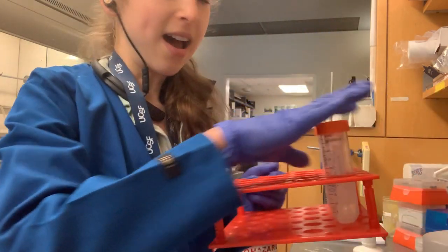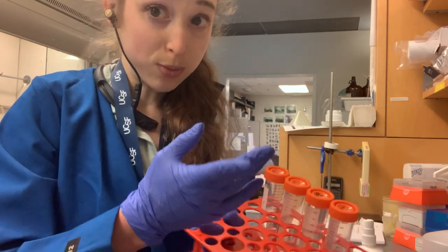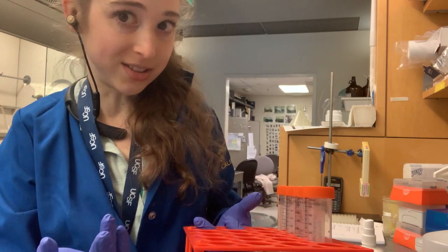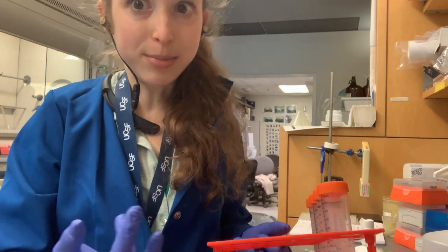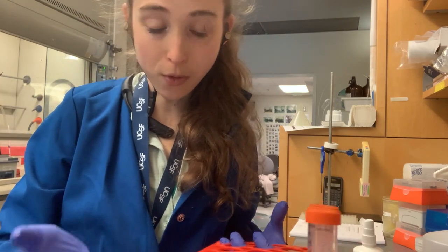I'm going to look at the top of the tube, which is why it's important that you label the top of the tube and not just the side. But you also don't want to label just the side of the tube because then when you take the cap off, you have that problem we talked about before.